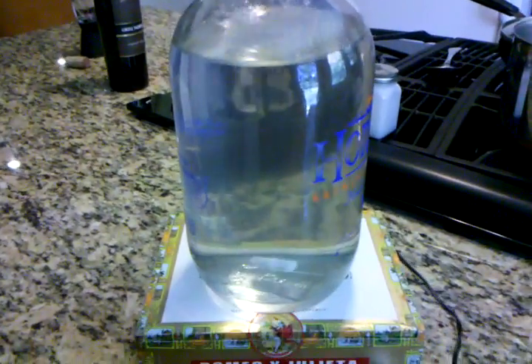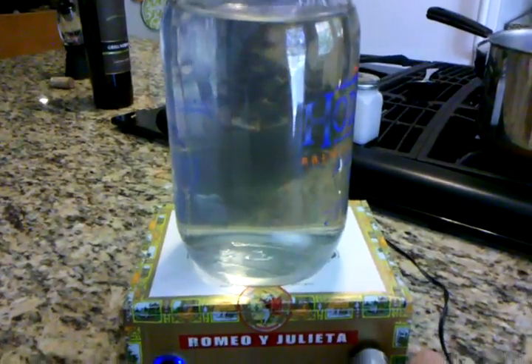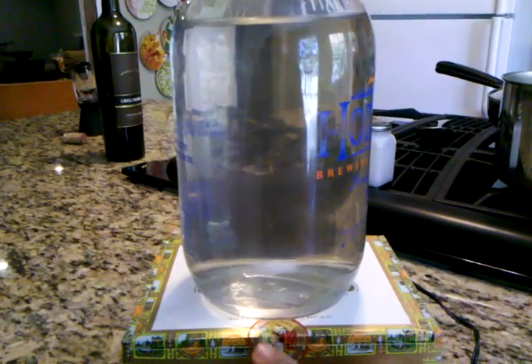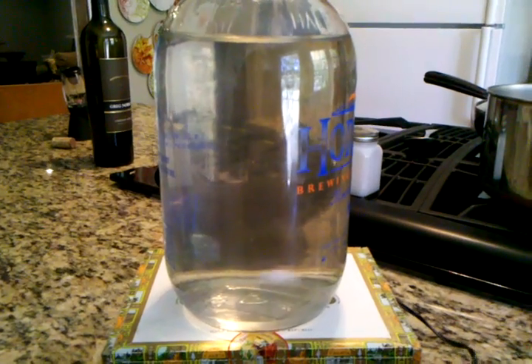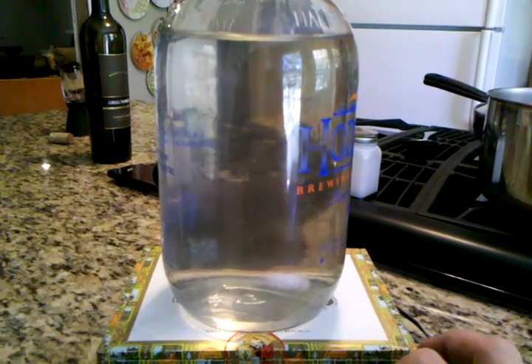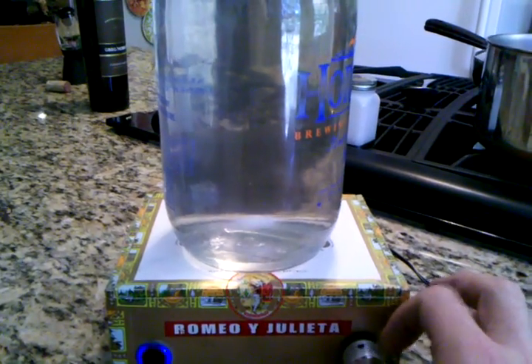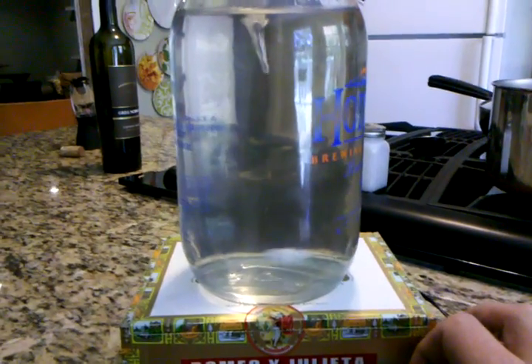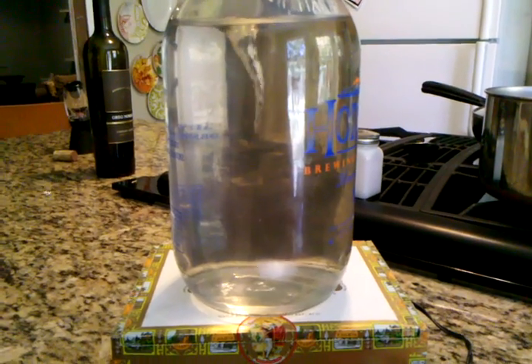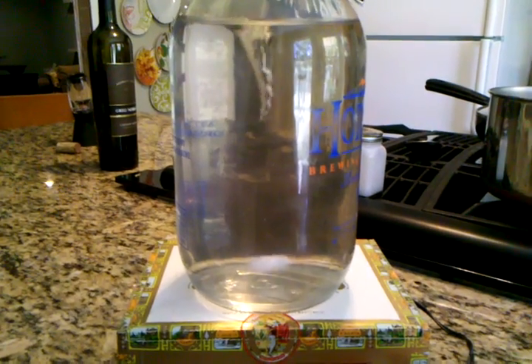Got the stir bar in there and flip it on. The bottom of that jug is convex so the stir bar won't sit still — I think I'm gonna get a big flask for it with a flat bottom. But I'm gonna turn up the rheostat and you'll see a nice little vortex going in there. I think it'll do the trick.